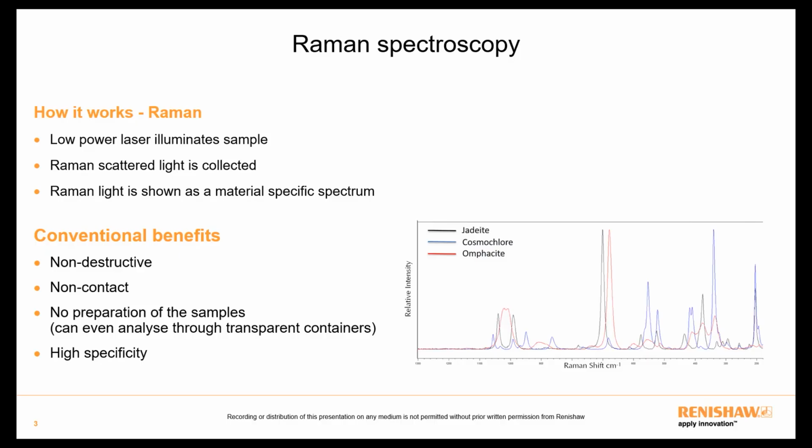Subtle differences, such as different polymorphic forms of the same material, where molecules have the same chemical composition but different crystalline structures, are analysed in the same way with the same simple and unique identification. Here is an example of different green stones within the pyroxene family. Jadeite, kosmochlor, and omphacite have similar compositions. Omphacite is a solid solution of jadeite, augite, and aegirine.